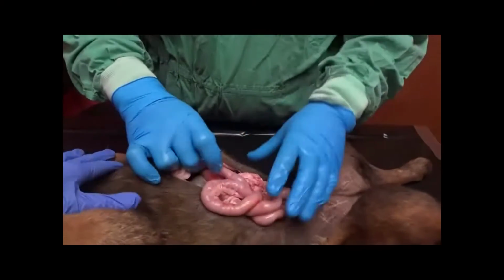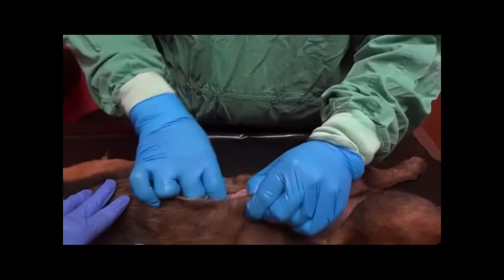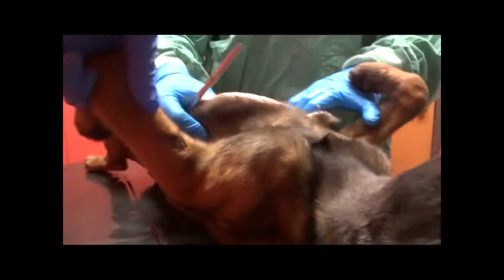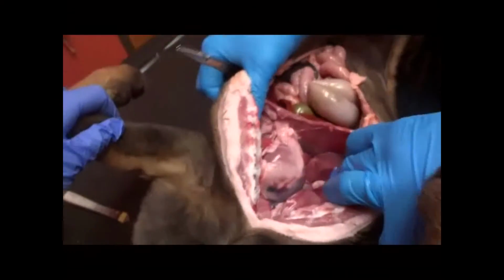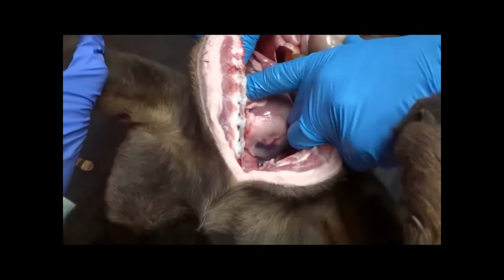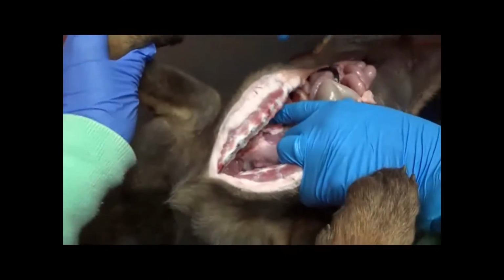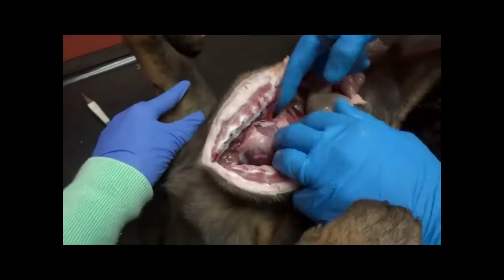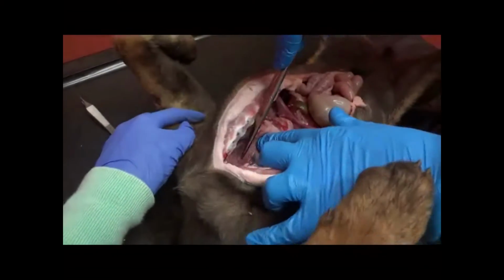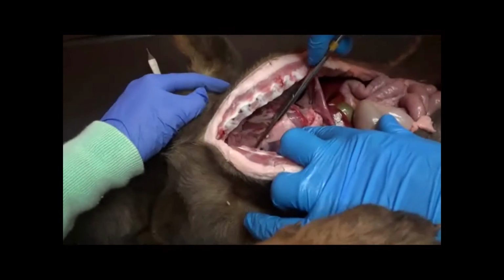I assume we need to do a thoracic portion as well. We can evaluate pretty well into the chest, rather, heart, surrounding lungs, and they're obviously deflated because of the post-mortem changes. So in a small dog like this one, you're going to have a lot of thymus. That's all thymus in the cranial mediastinum right there.